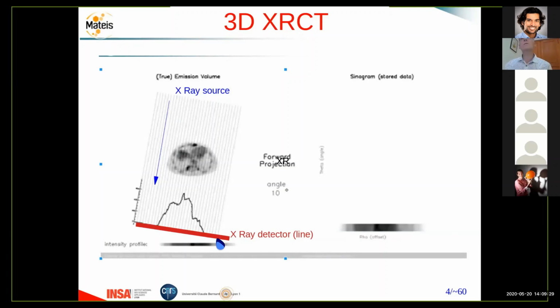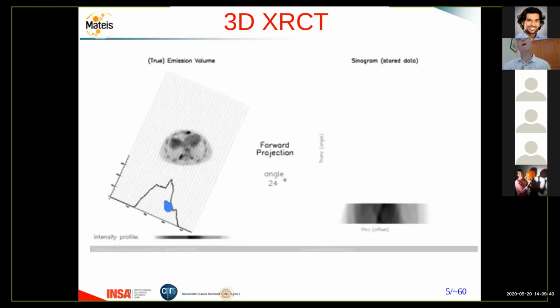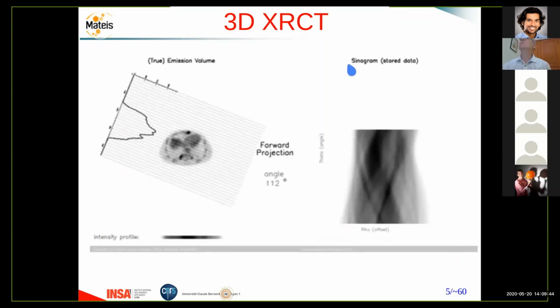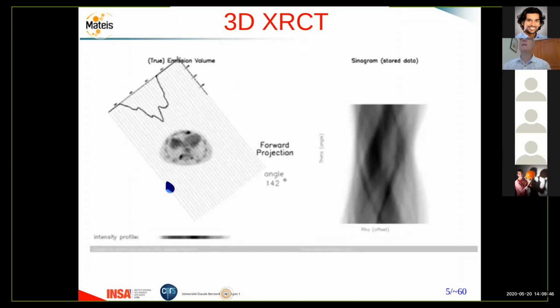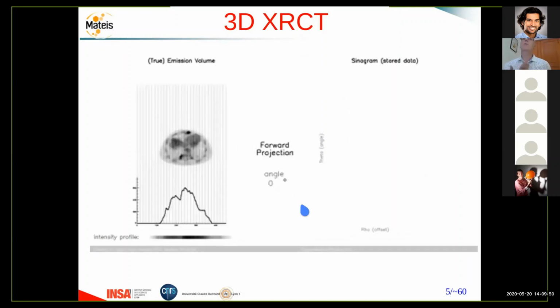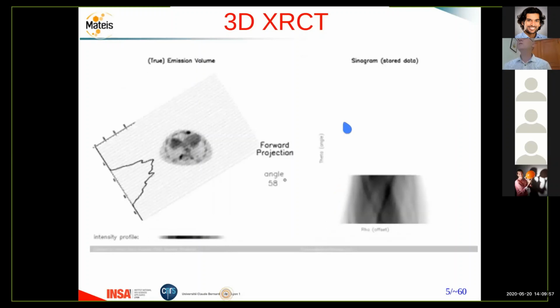And the principle of the method, rotation and transmission, is exemplified here. Instead of one of these projections, if you acquire a high number of projections, you will obtain what you have on the right, which is called a sinogram for this slice, which is the set of different attenuation recordings by your detector as a function of the angle. You see here the angle is changing.